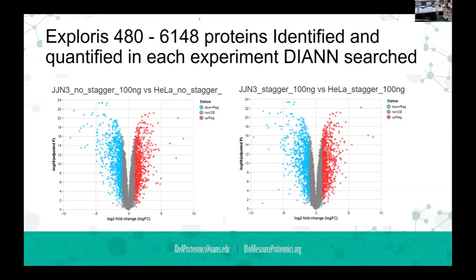That gave me a little more courage that our DIA data is working. You want to be able to run the same experiment 5 times and get the same answer all 5 times, but there's so much data and complexity coming out of here that it's not as simple as that. But that gave me some courage that it's actually working like it's supposed to.